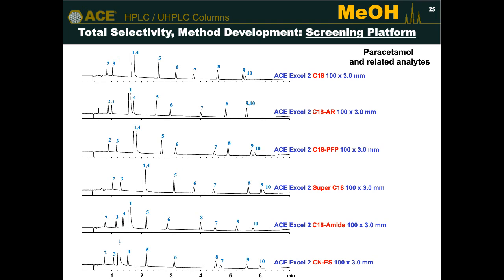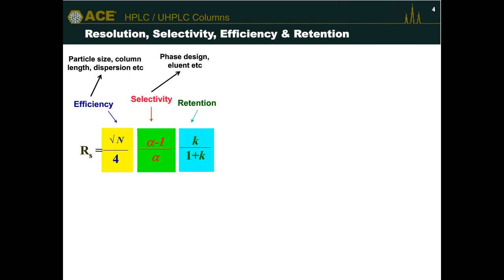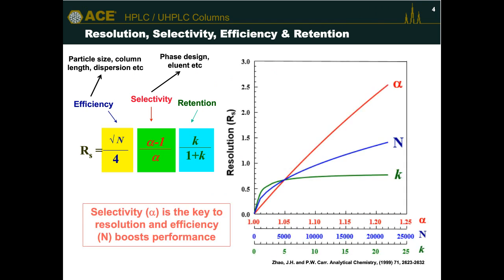Okay. All I can say here is if I go back to this slide, you can see that K, the green bar here, increases rapidly up to a K of nearly 10, and then it flattens out. So K values can be meaningful and very useful when they are low in terms of their impact on resolution, but very quickly it is the law of diminishing returns.